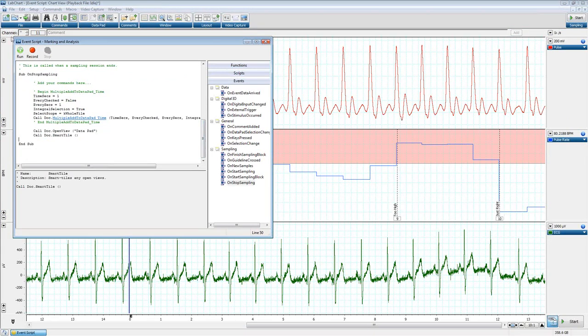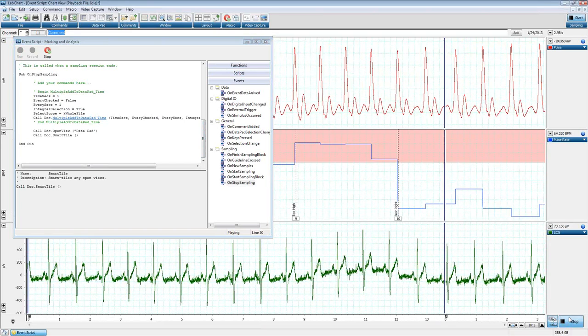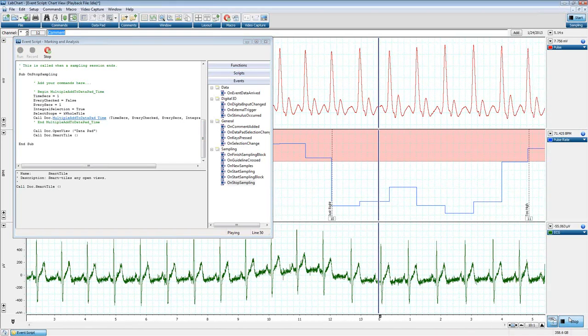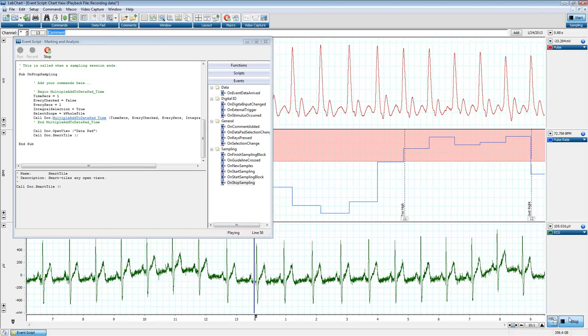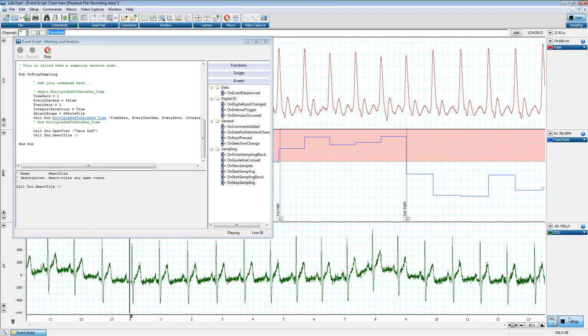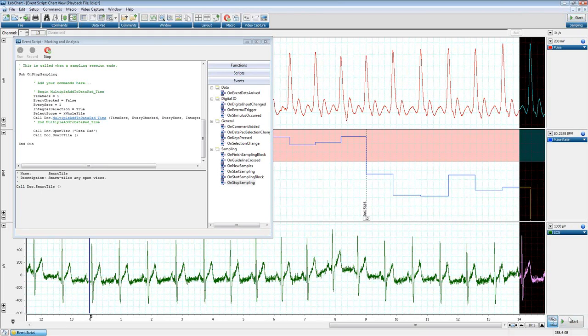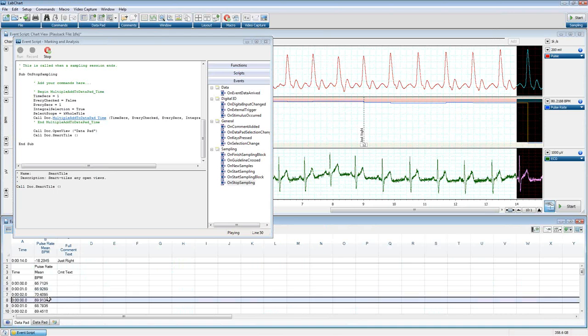Okay. So we're going to run our macro again. We're going to click Start. It's going to mark everything. And this should stop recording here in just a second. This data file isn't terribly long, so it should stop on its own here in just a minute, and it should do those steps that we gave it. Run our multiple add to data pad, analyze everything, open up the data pad, and now we have all of our data here.